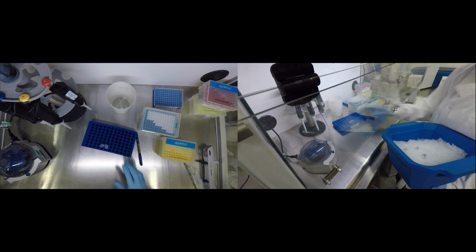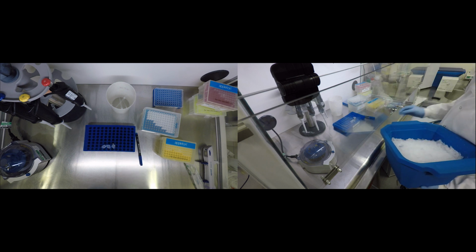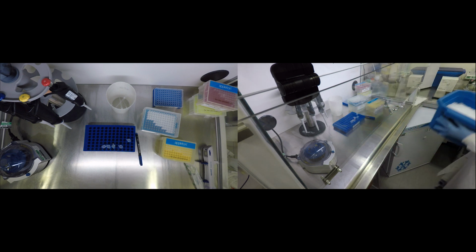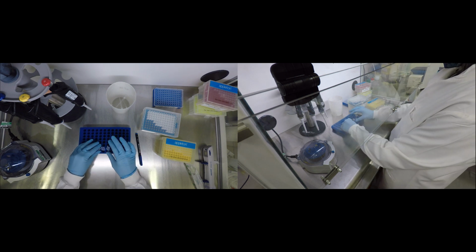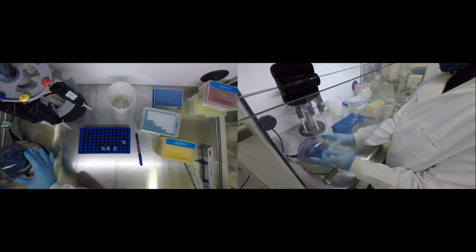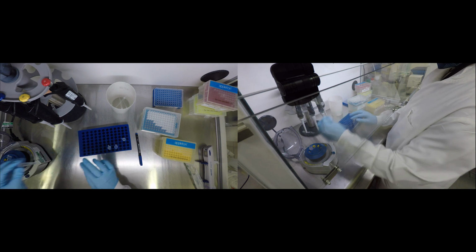Before any PCR setup or primer probe work, it's best to UV the work surface for at least 30 minutes. Whilst your working station is being UV'd in a closed cabinet, you can take your working stocks of primers and probes and reagent mix, along with water, out to thaw on ice. Make sure your reagents are not exposed to any UV light.